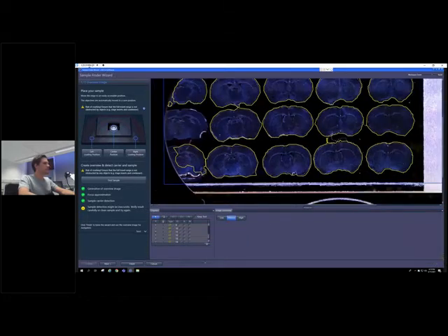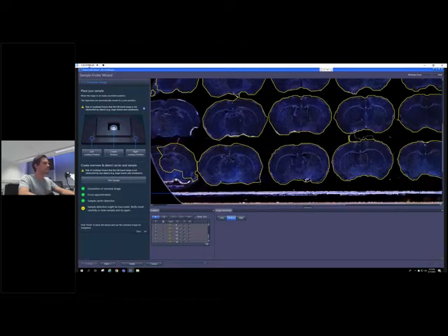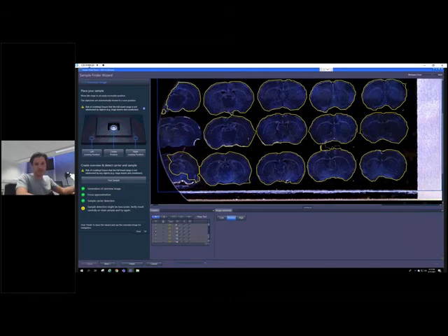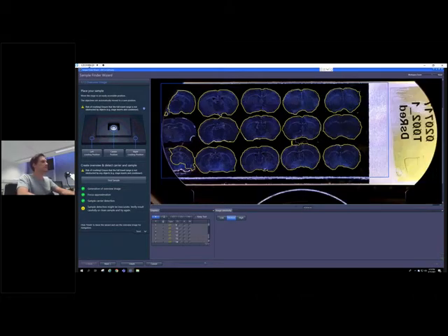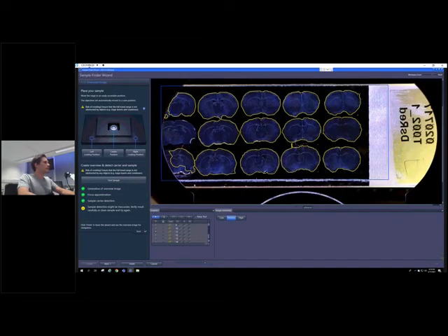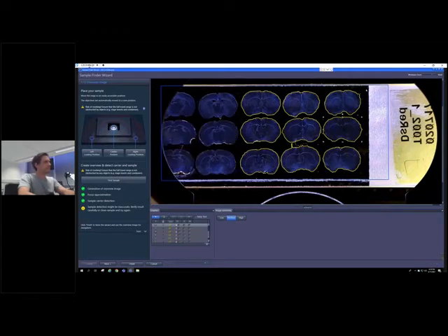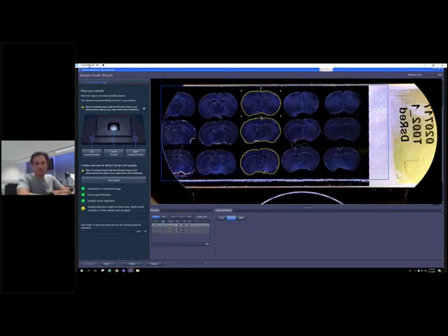So cut them away, get them separated here, or if you wish, you can also add further regions of interest manually. And that's what I'm doing here, to save some time, just going with those three central sections over here.